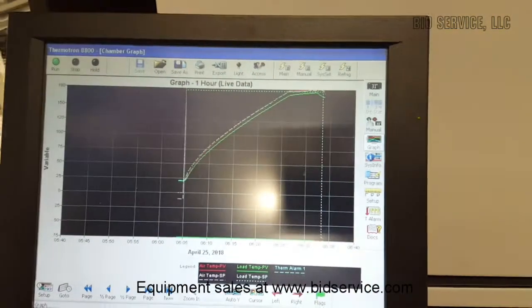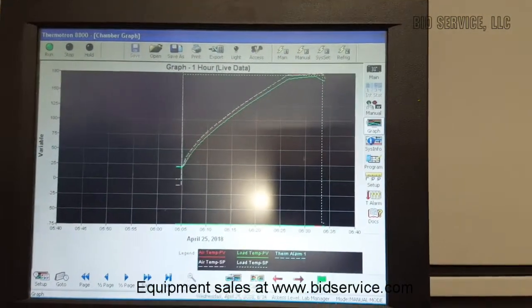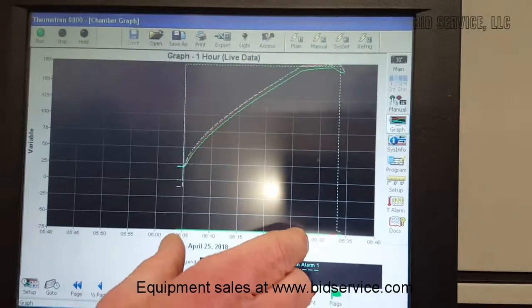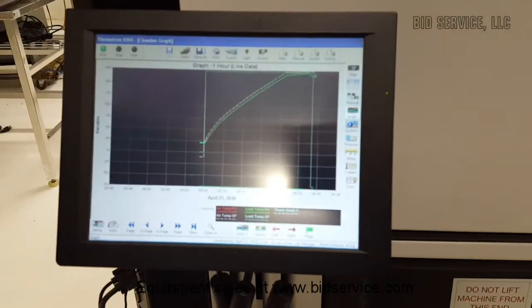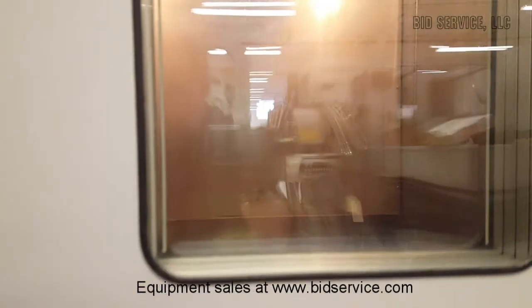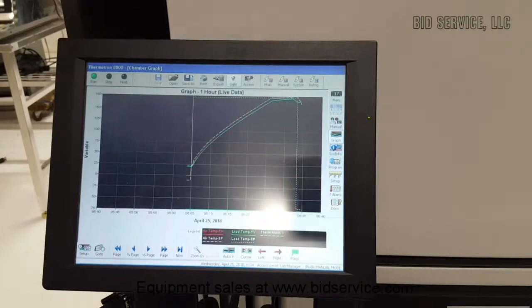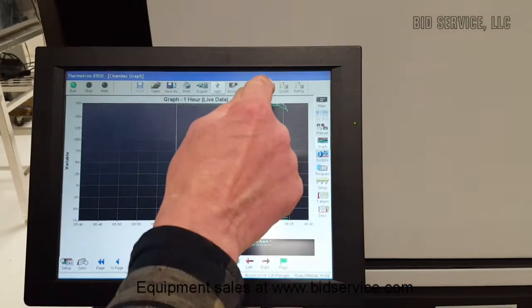All of this data can be uploaded into other systems as well. Here we can see our curve, where we started off at 25 degrees and made it up to 180 in about 42 minutes, which is pretty good. The reason this is running very well above spec is because, as mentioned earlier, we don't have any product in here. Because it's a large chamber, there could be a lot of product in there absorbing heat as well. This is the chamber as a standalone, and this one is absolutely excellent. We'll go back to our manual screen.